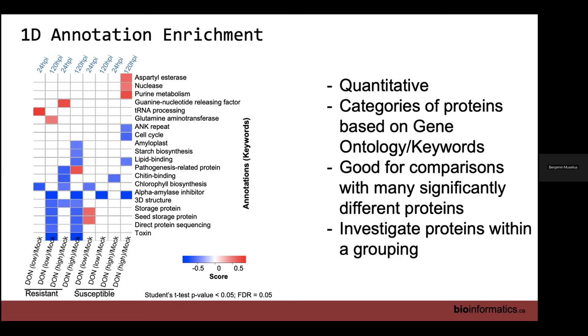So just a brief overview of some of the ways to visualize it. The slides are there in Perseus. You can go through the different screenshots that we've provided, but also please feel free to just try things out. Click buttons and see what happens. What image do you generate? How far do you get?